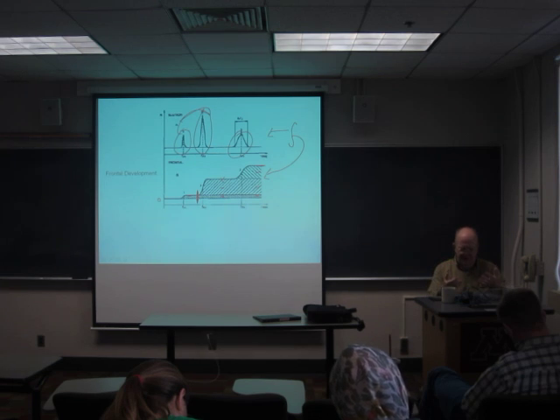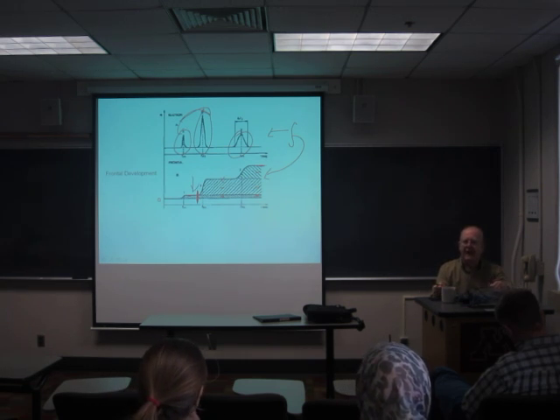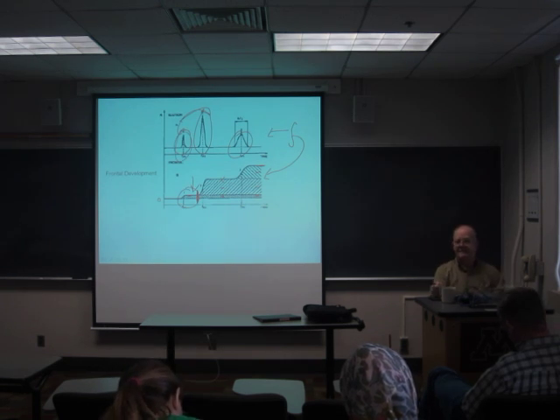I just want you to understand what's going on, which is why I showed the three component mixture. But this is really the only one that you can purify. And the virtue of this technique is that you can get a lot more purified one this way than you can that way. So this is actually used for purification of, you know, a scale-up kind of purification.